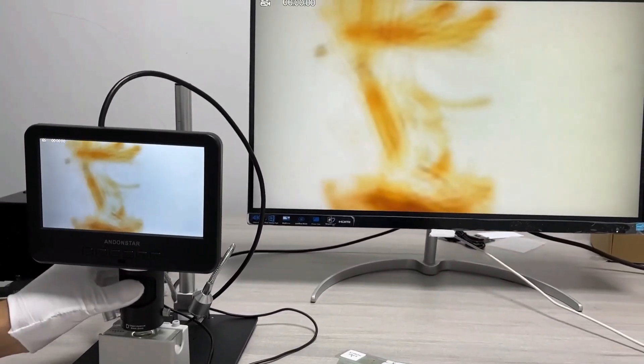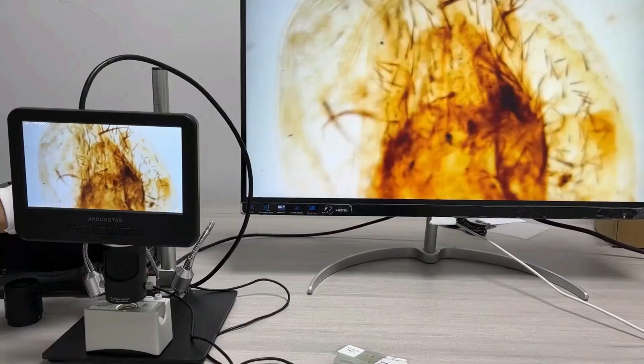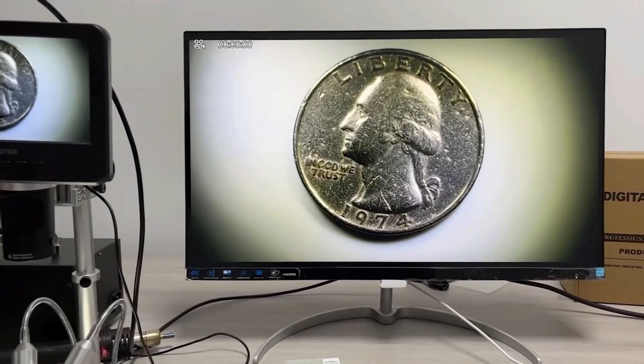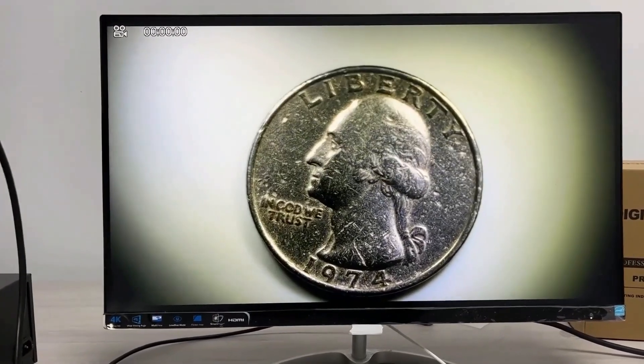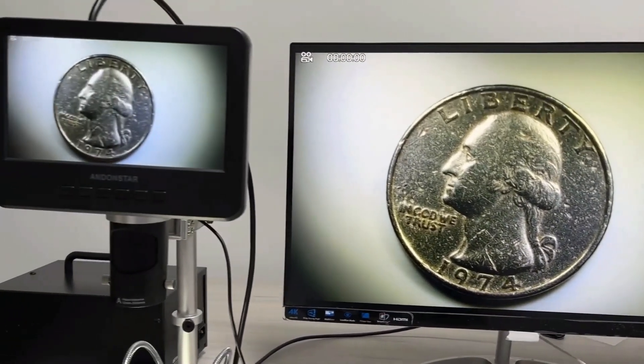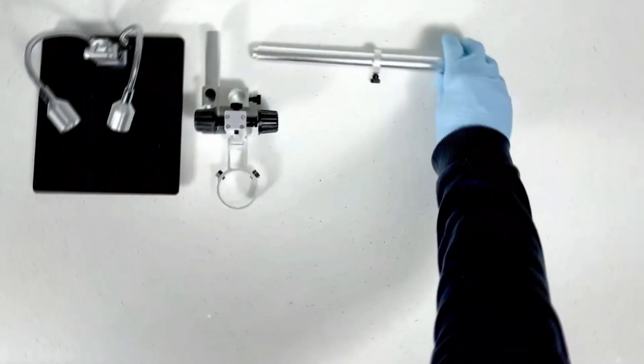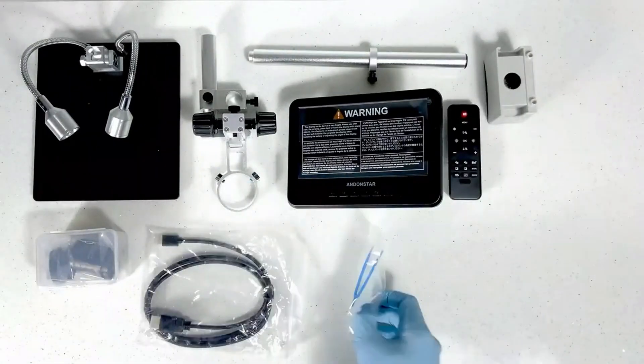Convenience is key too. The microscope comes with a wireless remote control, allowing you to operate it from a distance. It also features adjustable LED lights with 8 intensity levels, ensuring you can achieve the perfect brightness for your images. This is especially useful for educational demonstrations and other situations where clarity is essential.